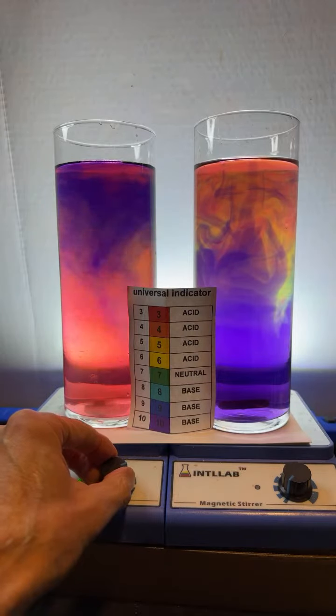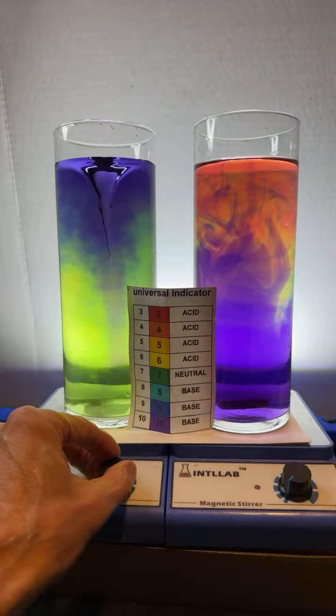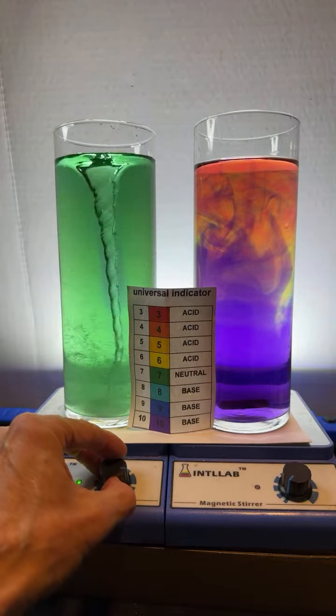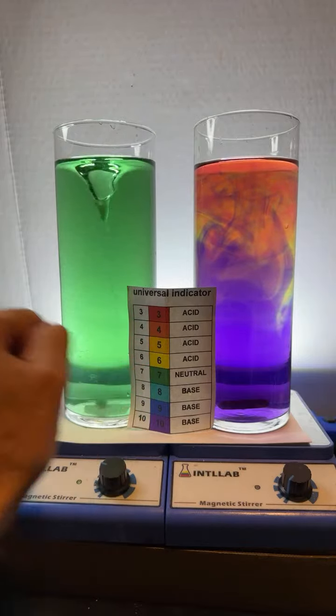Is Sprite without CO2 also acid? It is, because they add citric acid to it. Hey, look at that. I think it may be perfectly neutralized. Look at that. I added the perfect amount of acid and base. The two reacted, and they neutralized each other.